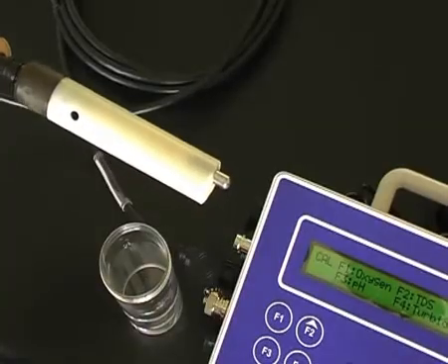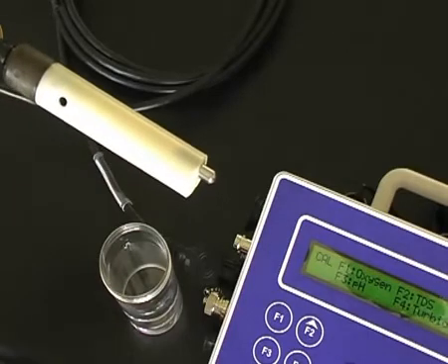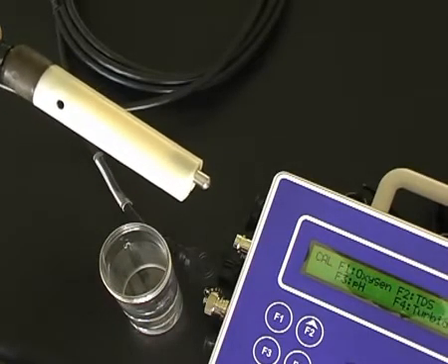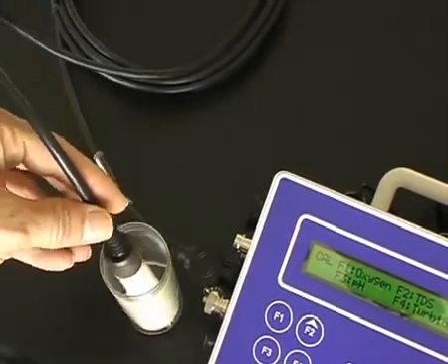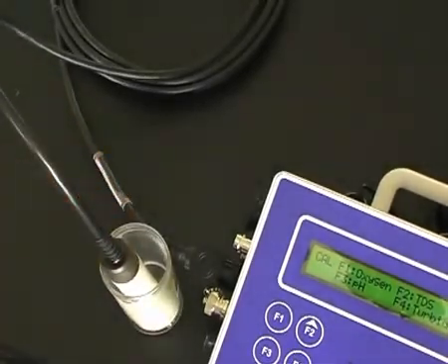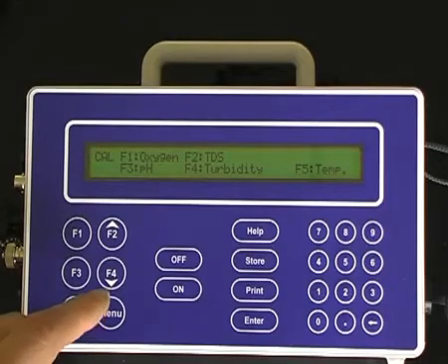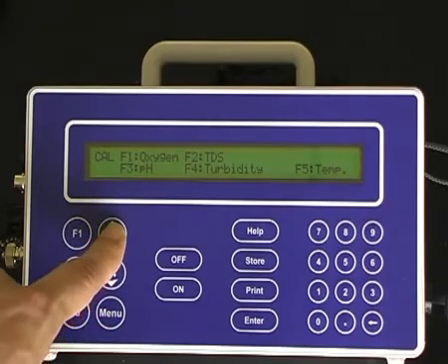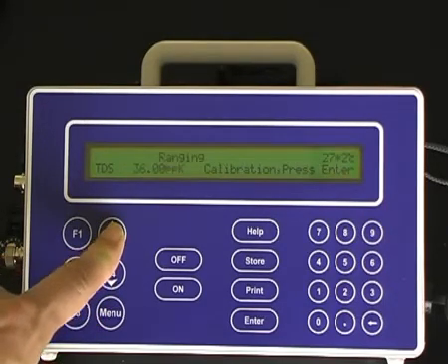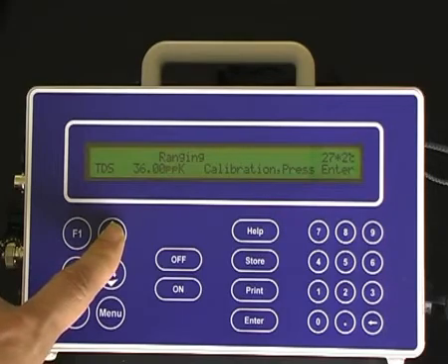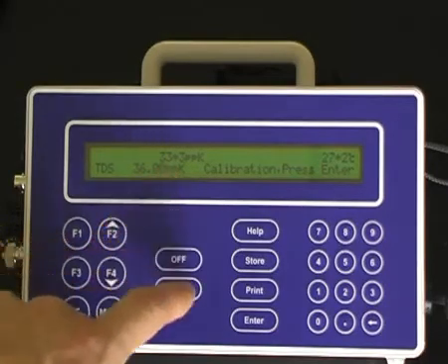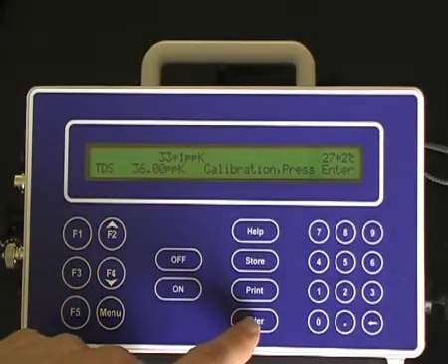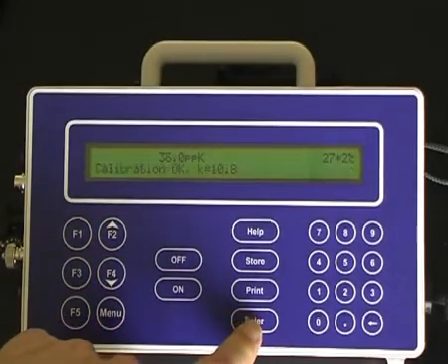The second point TDS sensor calibration is in a calibration standard. Ensure that the sensor is submersed past the vent hole in the solution. For the second point calibration, press F2 for TDS. Allow the sensor to equilibrate. Once it has equilibrated, press Enter for a second point calibration.